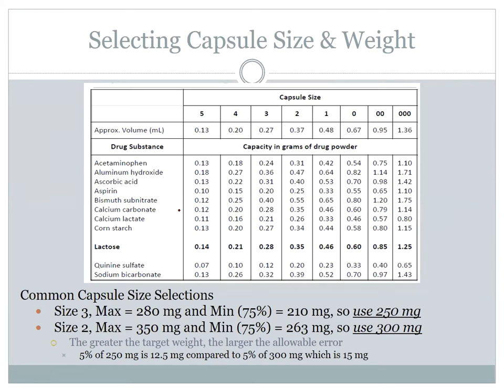And we're choosing lactose because it is an ideal chemical for using in capsules, because you'll see here it's compressible. If you mush it down, it stays down. It becomes kind of sticky, which is important because as you're punching up and down, you want the powder to stick inside the capsule. So that property of its compressibility and its ability to stick inside the capsule as you punch it makes it ideal for making capsules.